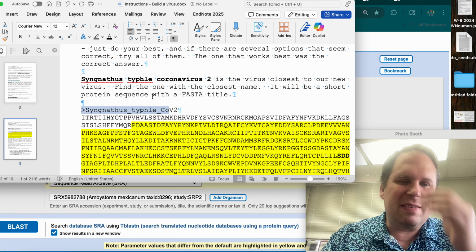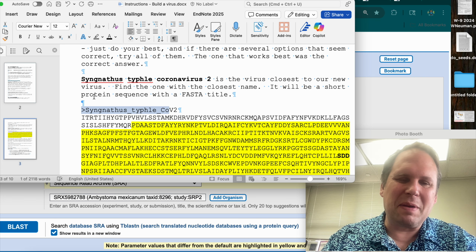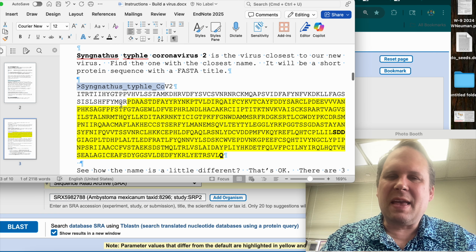Sometimes I'll leave off the species because I'm just going fast and I've dropped something. It's okay. I know where they come from. I can figure it out. I've got another bigger database of those. They're just not as clean as I would like. Yeah, and here it is.